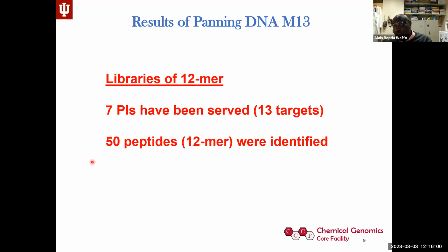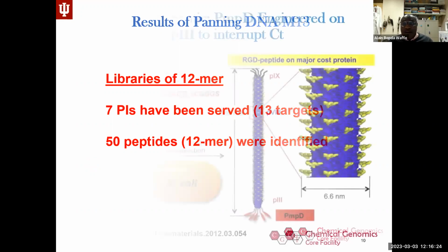And again, when we have those peptides, we can go back and do a reconstitution. If you want more than a peptide on the surface, if you want them to be fused with a linker, we can do that on the side. That means this is the result of my selection: 2 major candidates. I can put a linker between the 2 and see if they bind with high affinity to your target. So that can be done in the core.